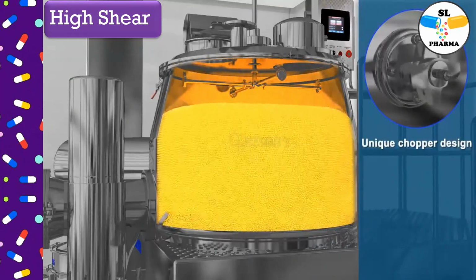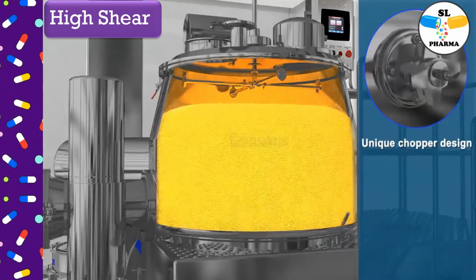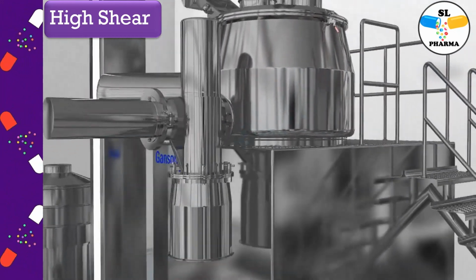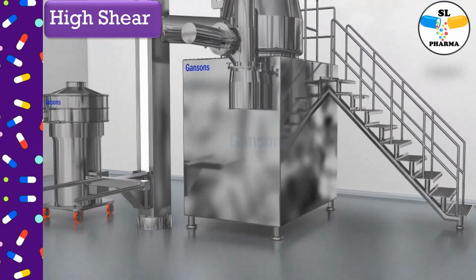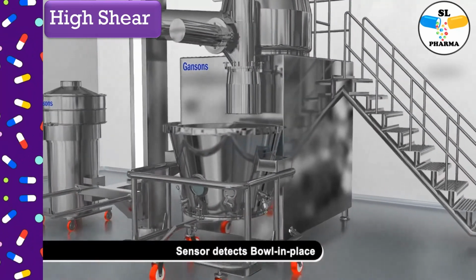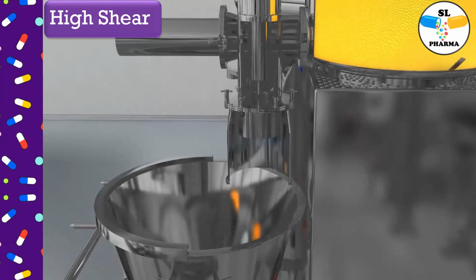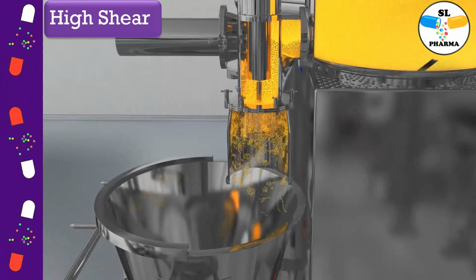Fourthly, granulation. The granulation process continues with intense mechanical agitation provided by the high-shear mixer. This agitation helps break down any lumps and ensures uniform distribution of the binder throughout the mixture. The formed granules grow in size and achieve the desired size and consistency.